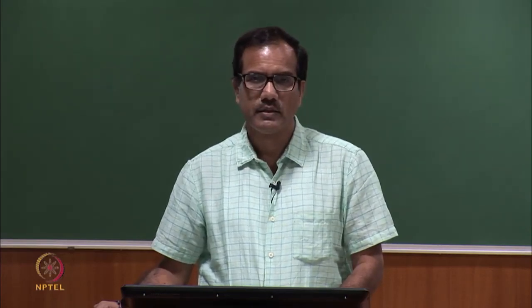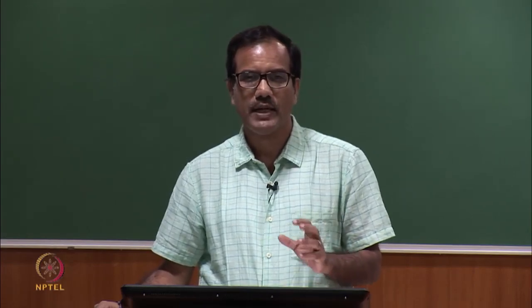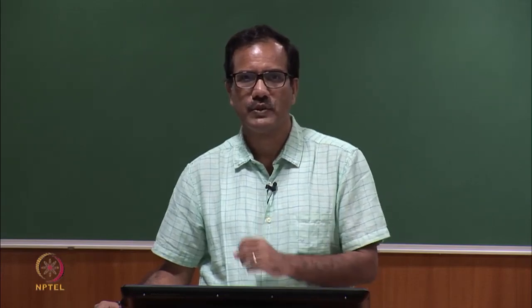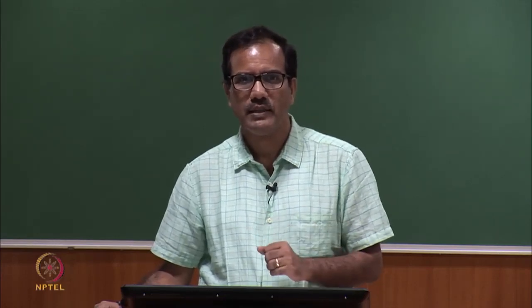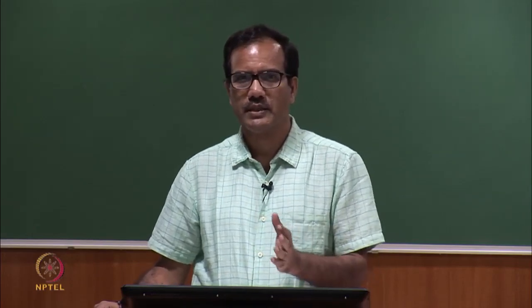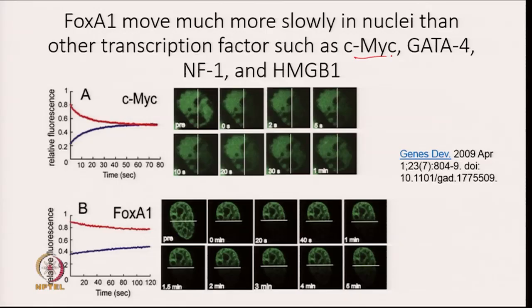Here in this picture, what has been shown is how FOXA1 moves in nuclei in comparison to other transcription factors, for example c-Myc. FOXA1 is also a transcription factor, and what you are trying to look at is how it moves in nuclei. So now look at this.